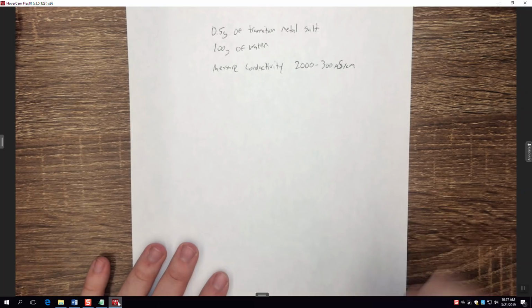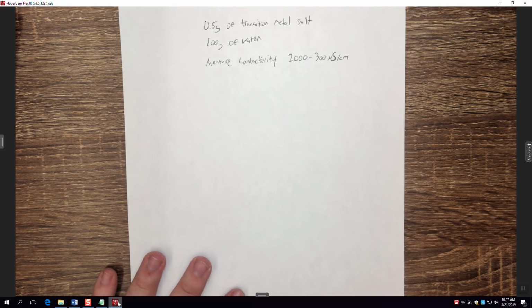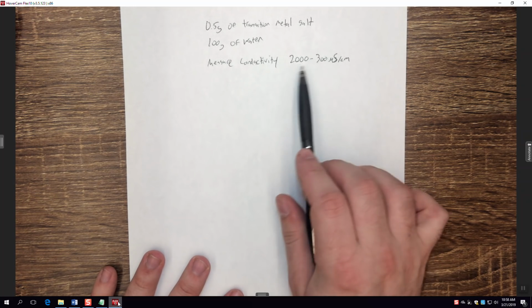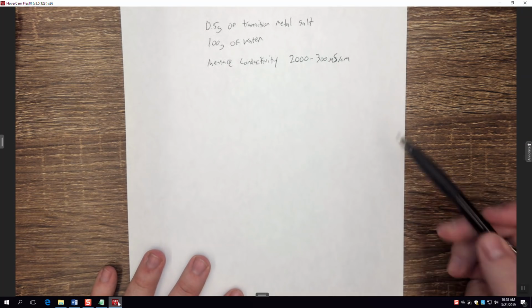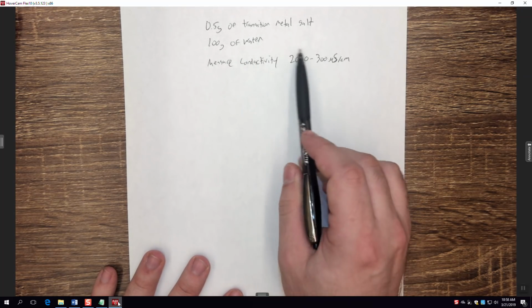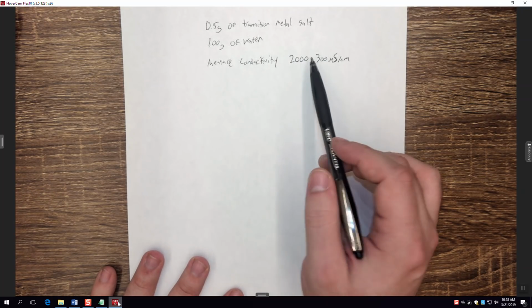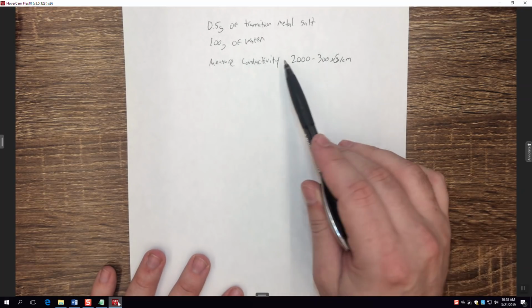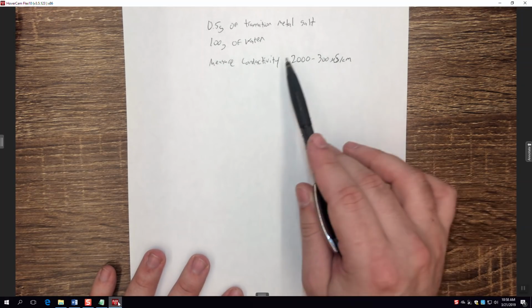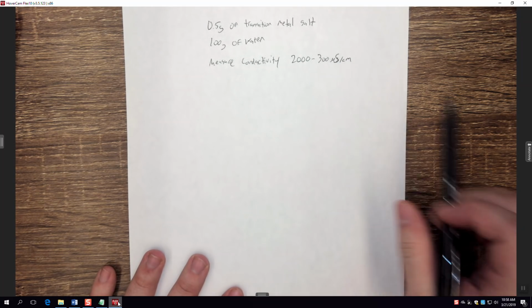So we're going to dilute it by tenfold. Now, why have I chosen tenfold? If you'll notice, this is our linear range, between 2,000 and 300 microsiemens per centimeter. That range is almost exactly tenfold. So if we end up anywhere above this range, even exactly at 2,000 microsiemens per centimeter, and we dilute tenfold, we should still be on this range. By diluting tenfold at a time, we should not be able to overshoot the entire range from above 2,000 to below 300, so we can ensure that eventually we land somewhere on this range.